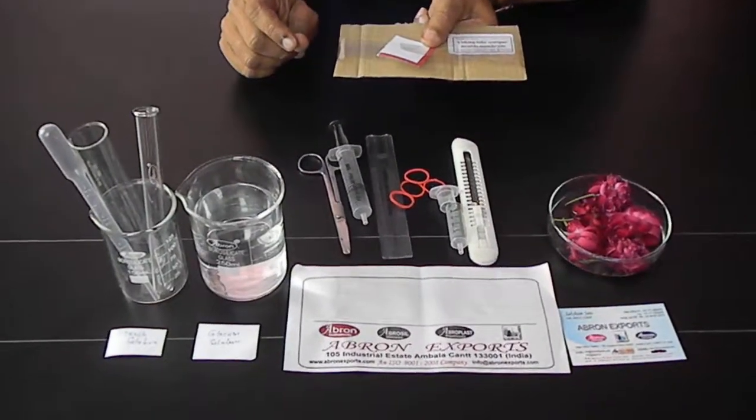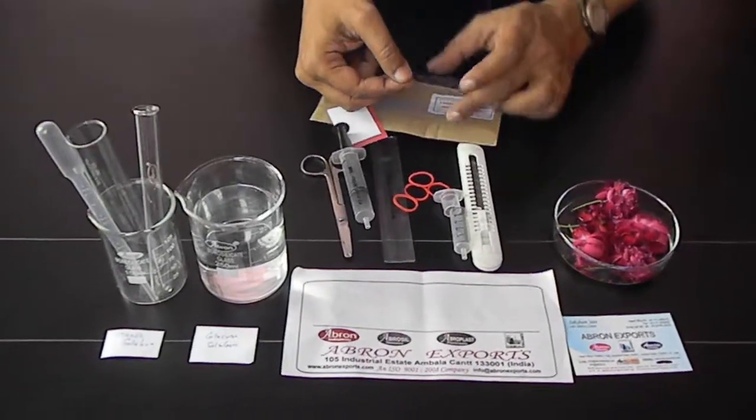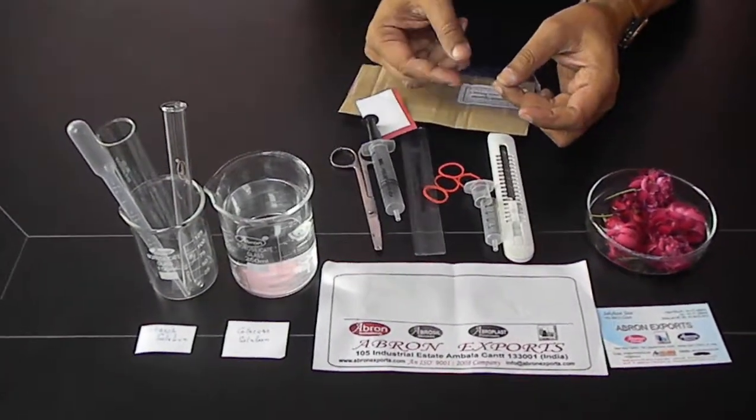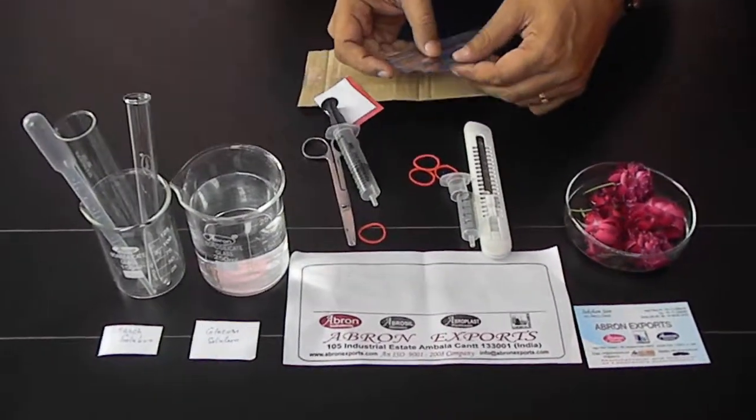We will send you a link on YouTube. There are many videos on YouTube. First of all, this is the simple whisking tube. With clean hands, you cut about 6 or 7 inches from this.